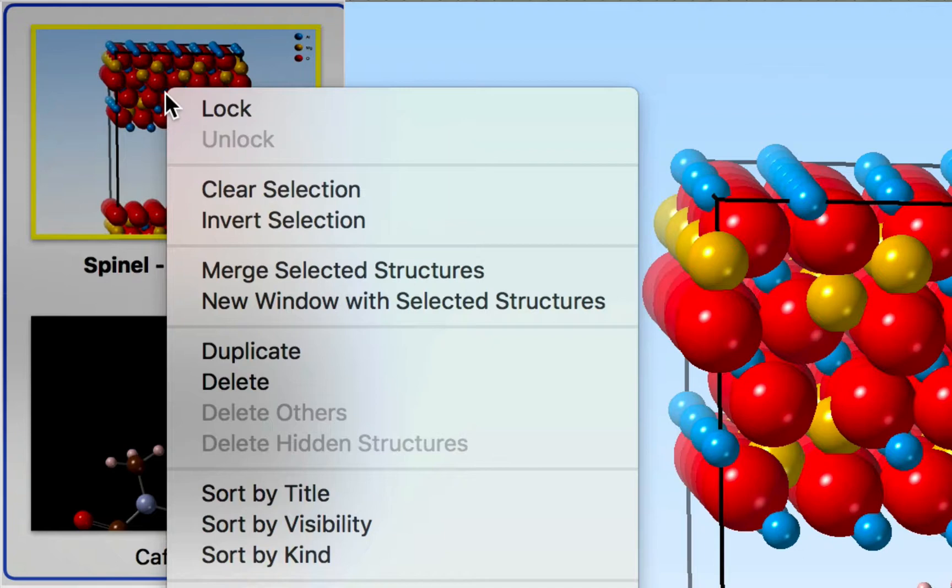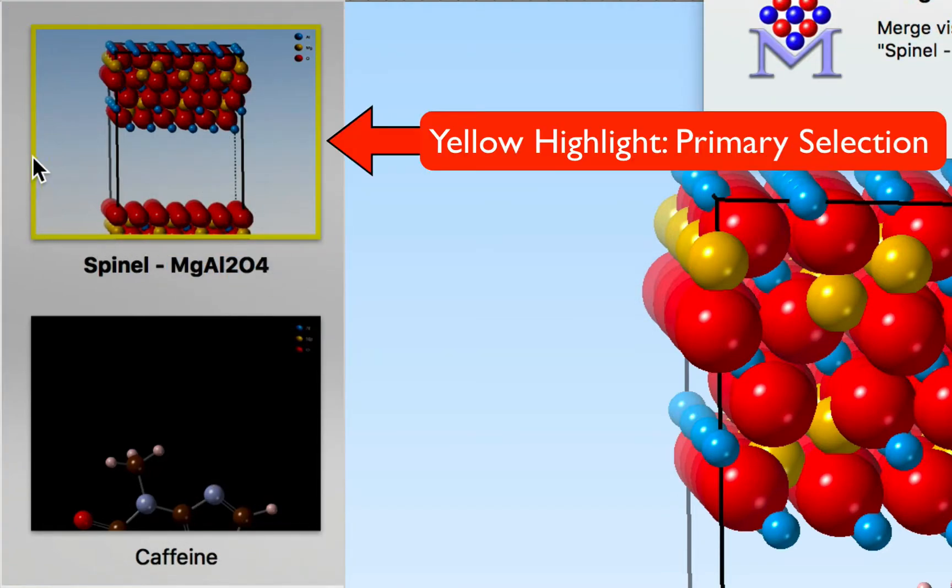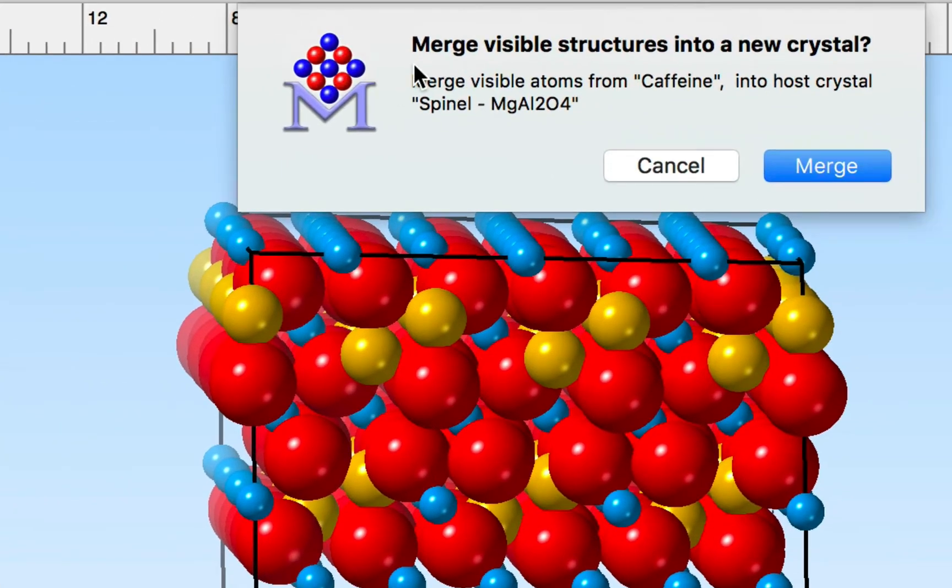I can right click in the structures list and I can do merge selected structures. Now the order here is important. You'll notice that the spinel structure has got the yellow highlight around it that's our primary selection and so what we're going to be doing here is we're going to be merging atoms from caffeine into the primary selected structure the crystal. The little sheet here tells me what's going to happen and that's what I want to do so I'm going to click the merge button.